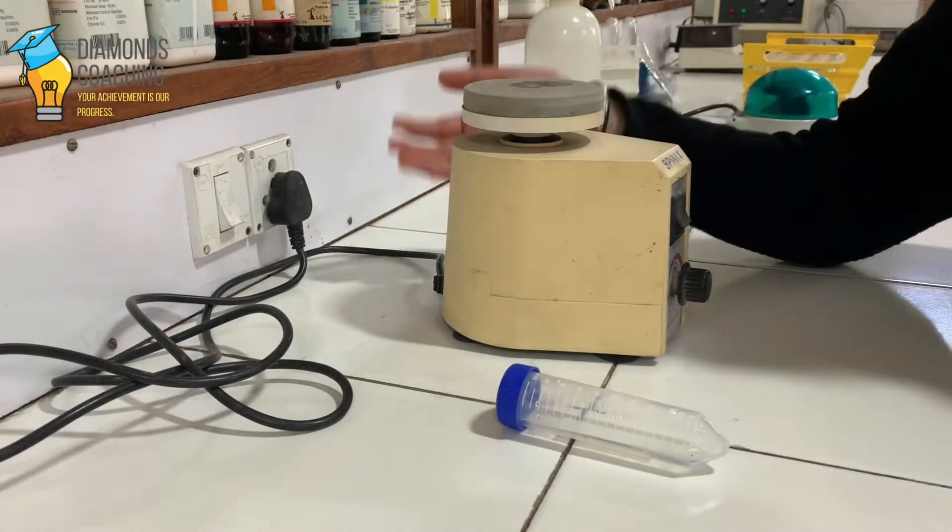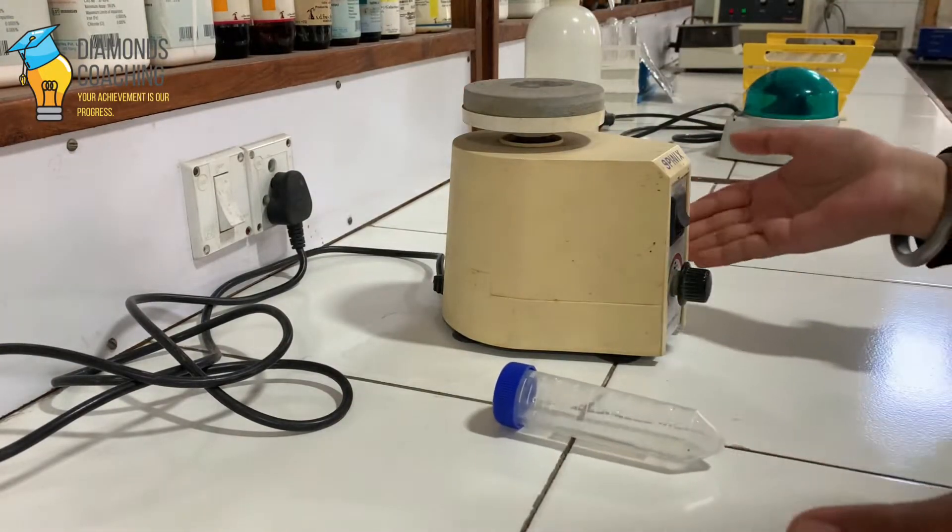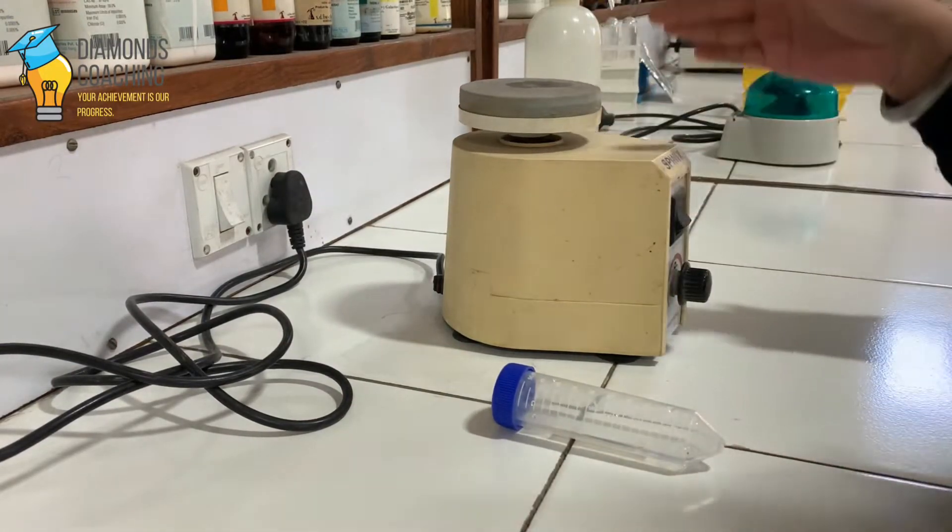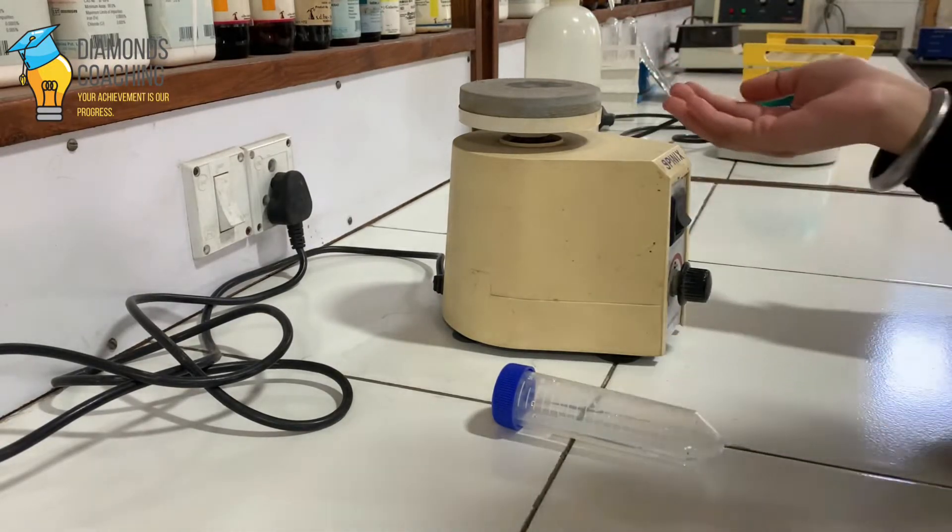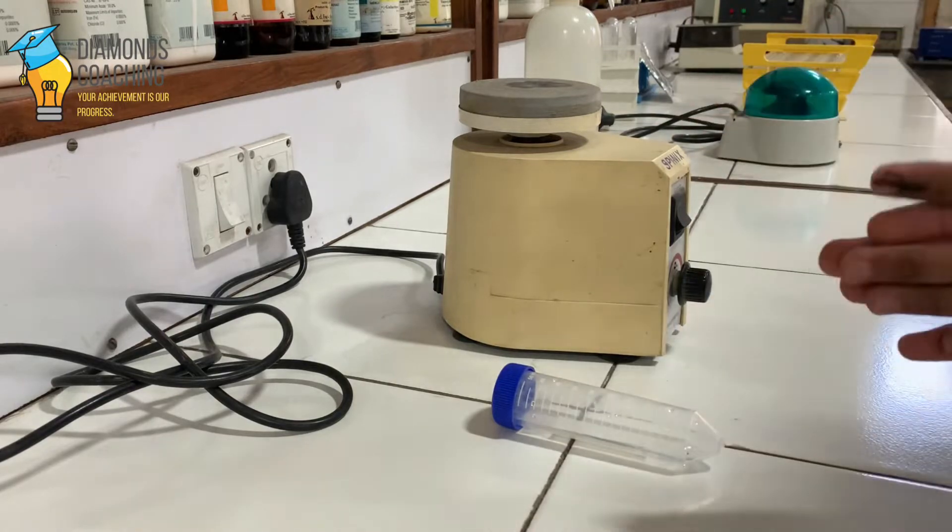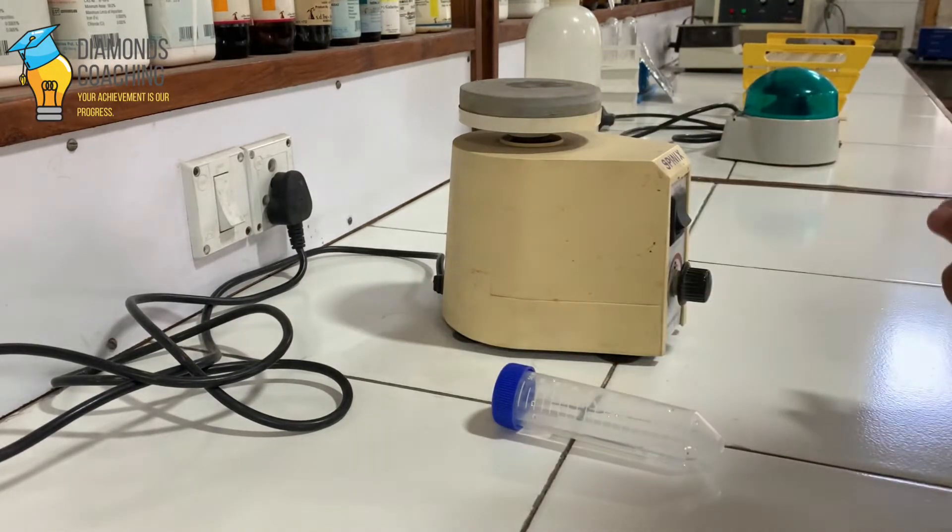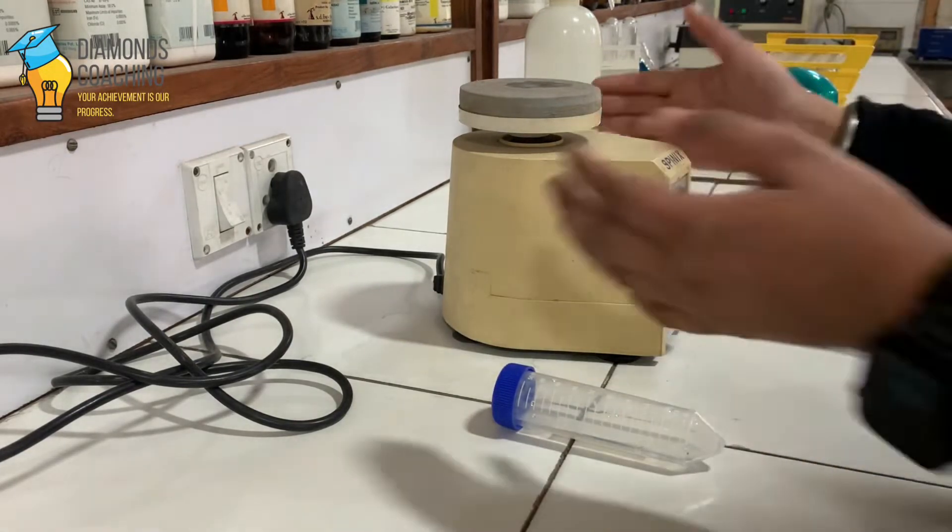Hello students, welcome to Diamonds Coaching. Today we are going to learn about this vortex mixer, vortex shaker - what it is, how it works, and what its applications are. So let's begin without any delay.